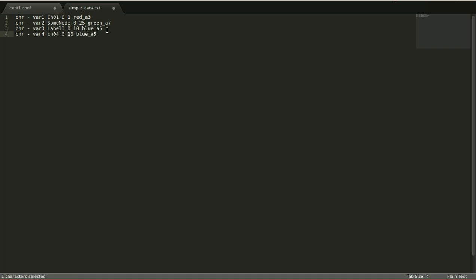It's going to have a length of, let's say, 5. I'm saving it.